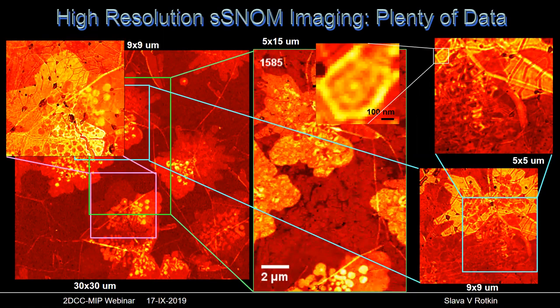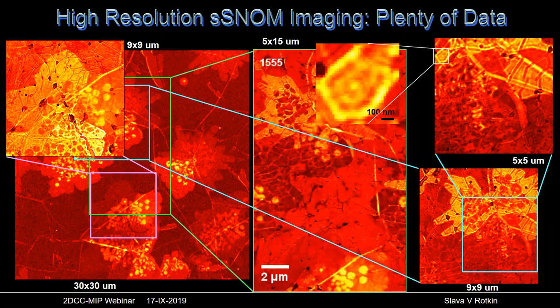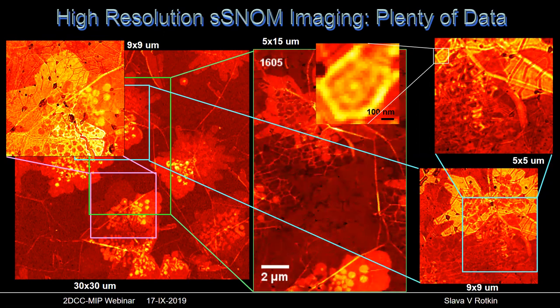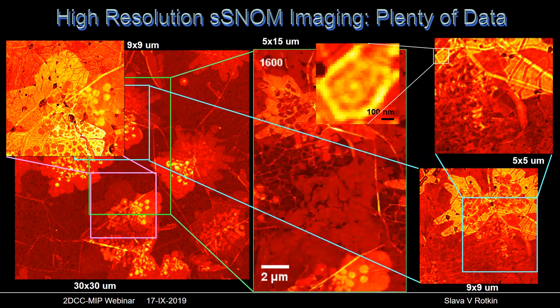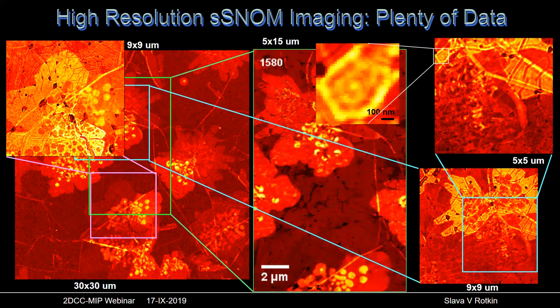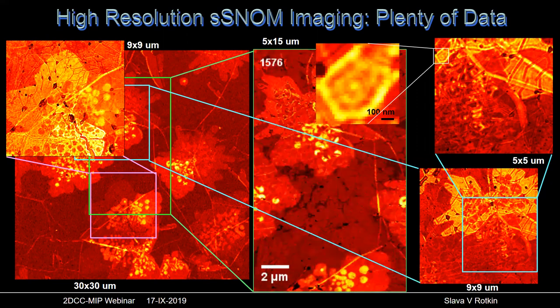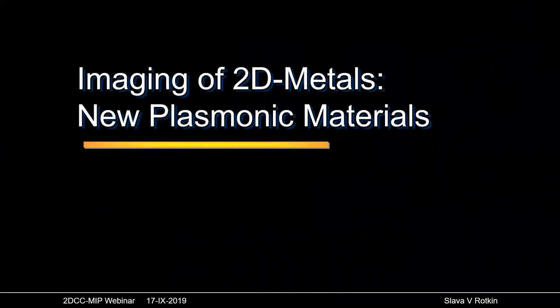What I wanted to demonstrate with that image, without talking in detail about any of this, is that typically a few hours' session on the near field optical microscope produces a whole lot of data. We definitely see something. The major question is, what exactly do we see with the near field optical microscope? Can we provide an interpretation of those images? For the rest of my talk, I'm going to focus on the interpretation of those images for several materials. For some of these materials, we understand the physics or material science better. For some of these images, additional studies will be required.